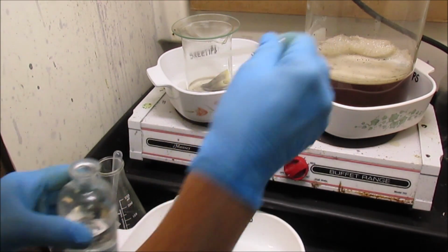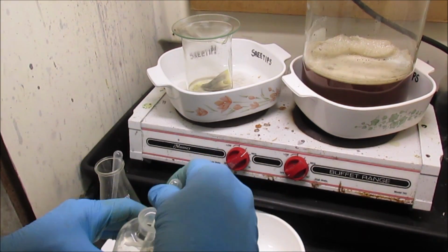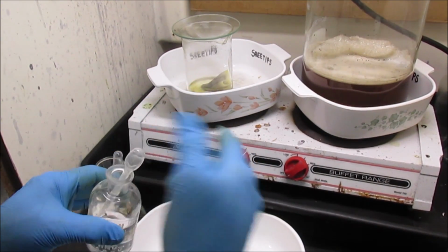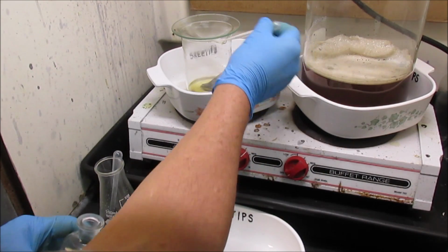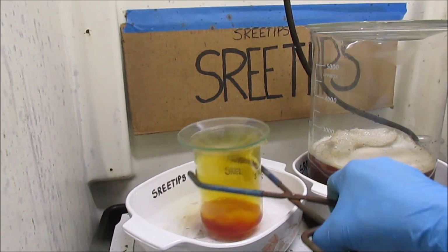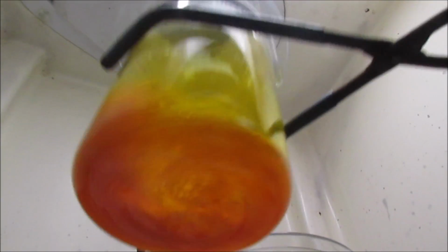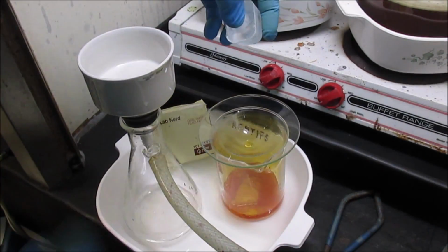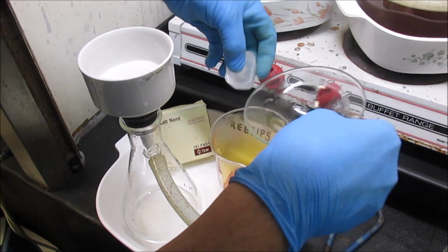This will be the third time. That's 2, 4, make it 6 ml. About 2.5 minutes. And I think we got everything in solution. It's all dissolved. Pull it down off the heat, let it cool. I'm going to add an ice cube here, cool it off.